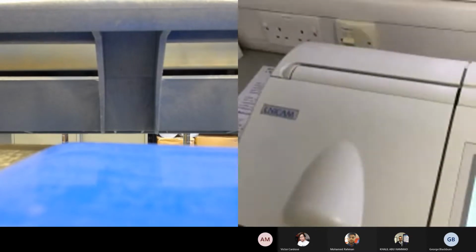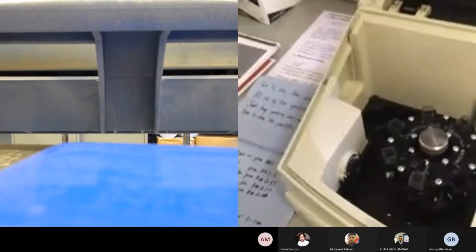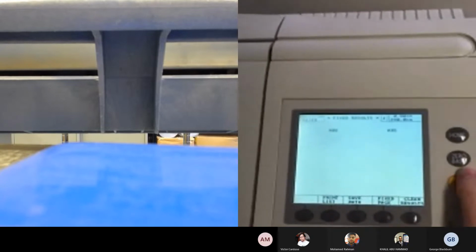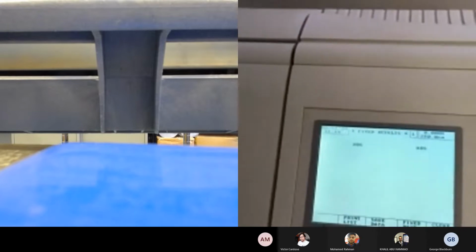And as I think Steve mentioned, this part will turn, so we don't have to change the cuvettes between each reading. And one sample is the blank, is that right, Thomas? Yes. So we'll rotate between the blank and the sample you want to measure each time.